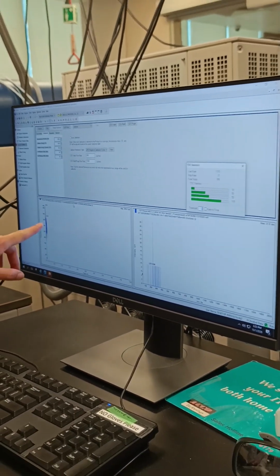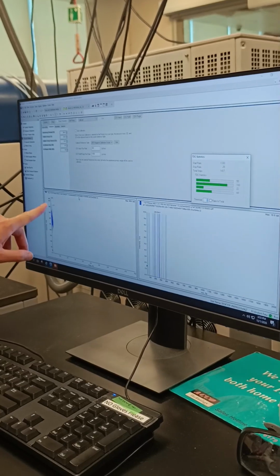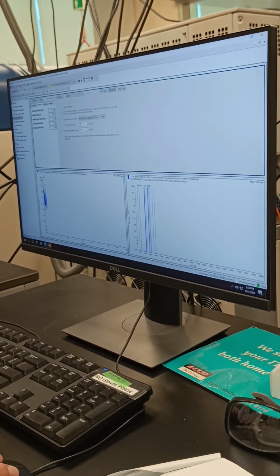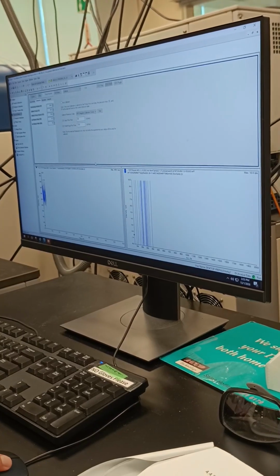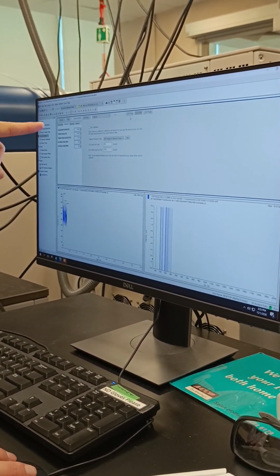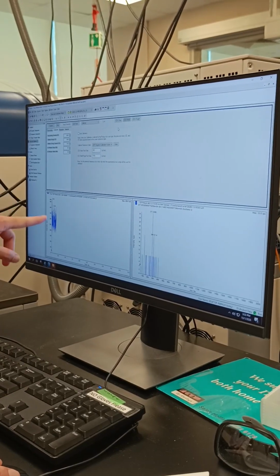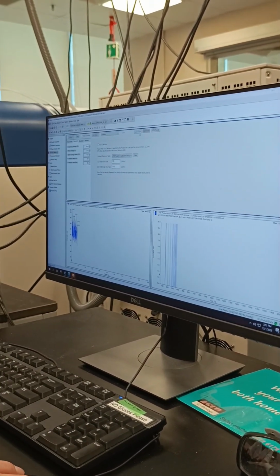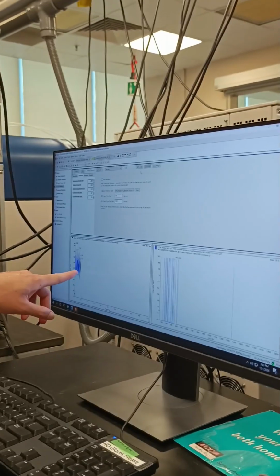So this one by default, the TIC here will be low, the reading will be low as expected. So what I need to do now is to inject. I'm not sure if it's a bug because sometimes after you click CDS inject, you won't see a peak here. You don't see anything spike up. Which means you need to refill it in this case. Yeah, because it's not spiking out, right?